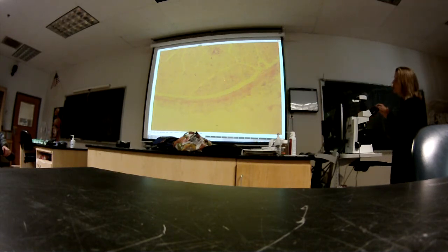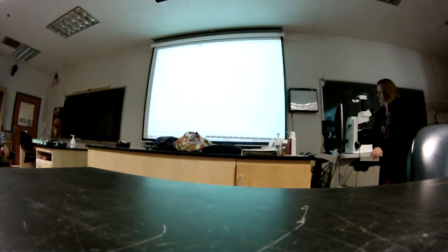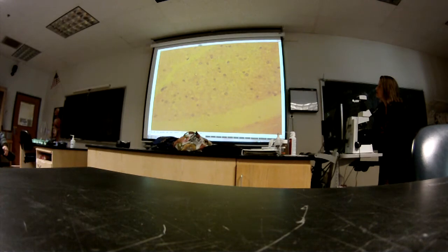And so one of these structures, not the layer, but the structure. Endo. Talking about the layer? Not the layer, but the structure. I can go closer. A myelinated axon? Yeah, exactly. Mozzie said it first. Good, Monty.